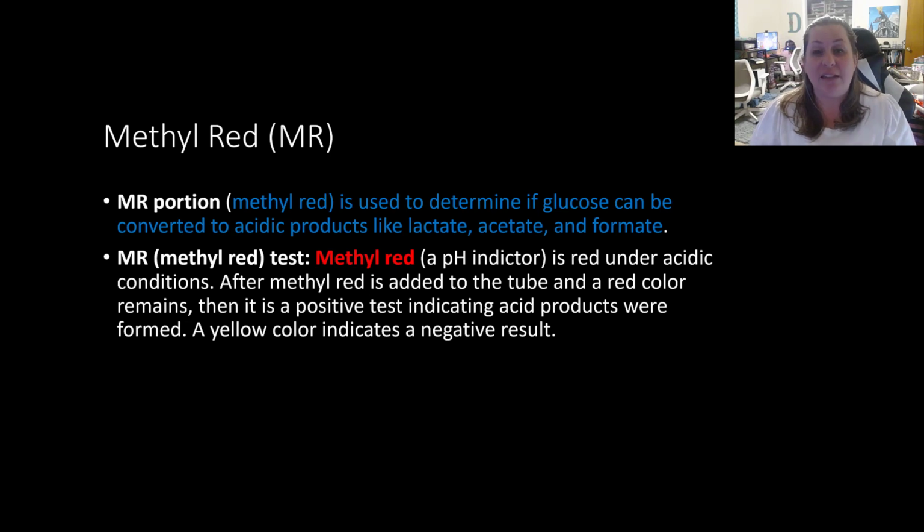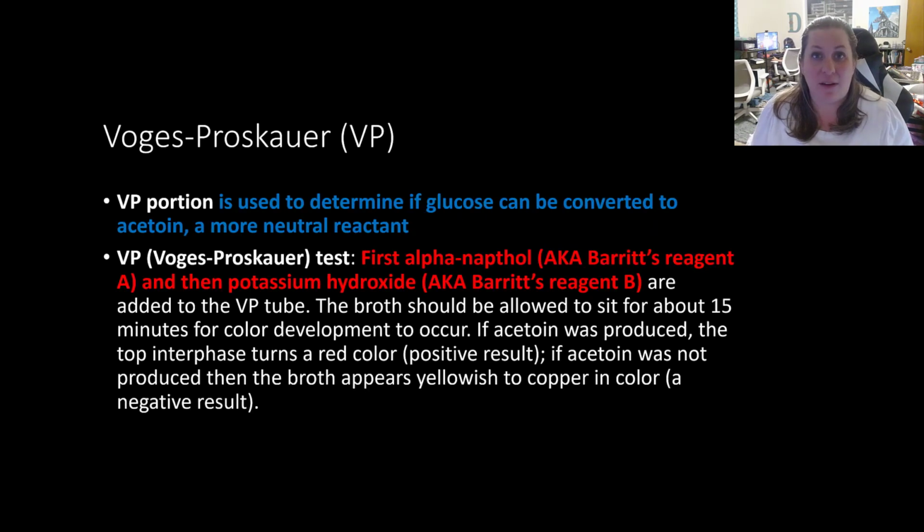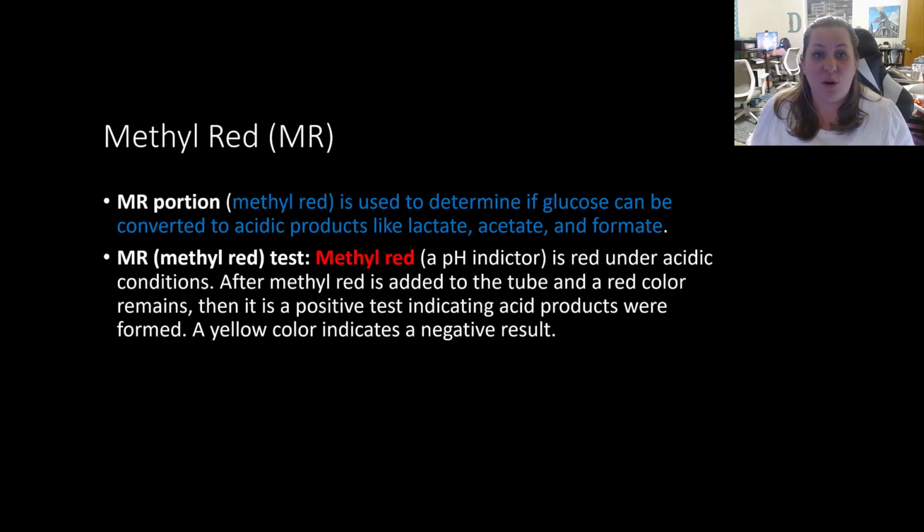This tells us that acid products were present in this particular test. So if acid is present here, it will remain red. If it changes to yellow, then the result is negative. And I'm going to show you a picture of these in just a minute.